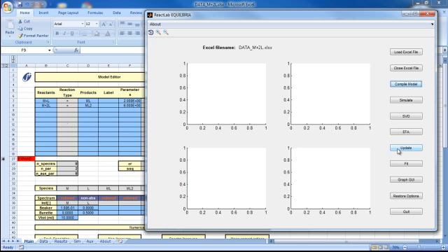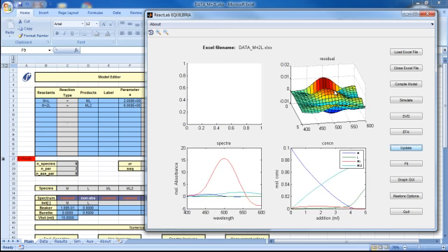This function computes how well the model with our initial parameters matches the data prior to undertaking the fit itself. We can see these starting parameters do not result in a good match of the model to the data from the distortion in the residual surface and the negative excursions of the spectra, but they will provide an adequate starting point for the fitting algorithm.